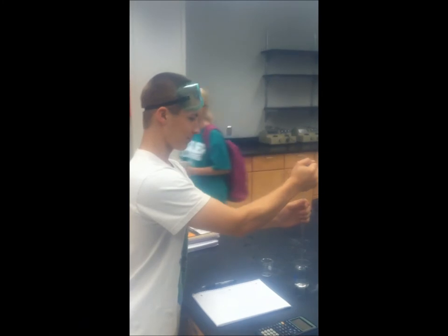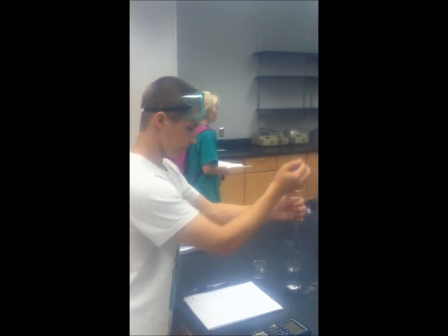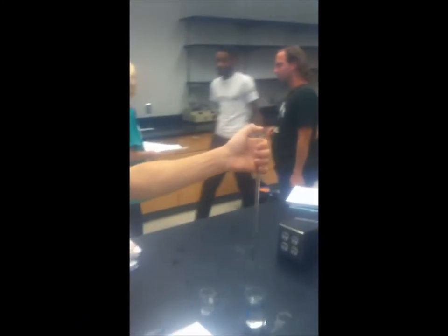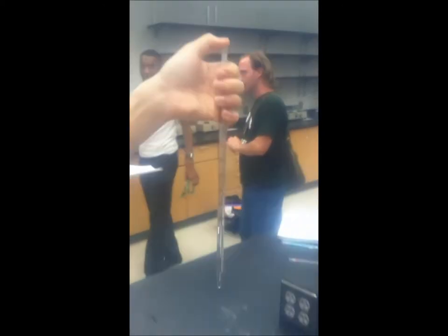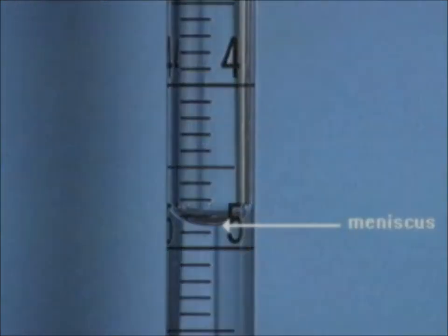The first thing you're going to want to do is draw water into the pipette from the main beaker and get a measurement from the bottom of the meniscus. A meniscus forms because polar molecules in the glass and water are attracted to each other, therefore the water tends to cling to the sides of the pipette. You should always read the measurement of the volume from the bottom of the meniscus.